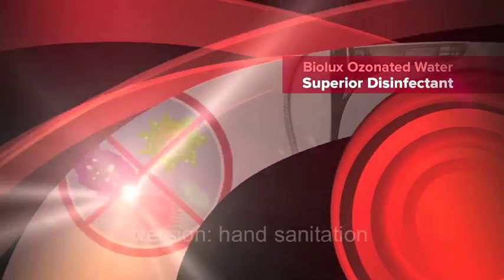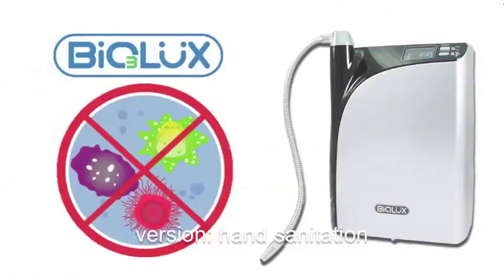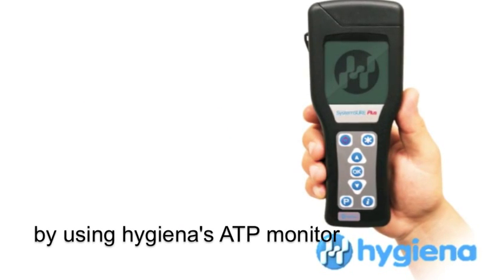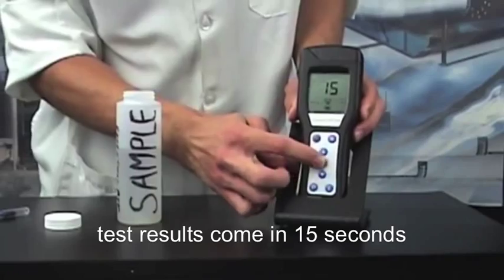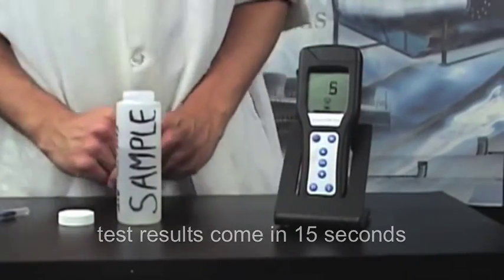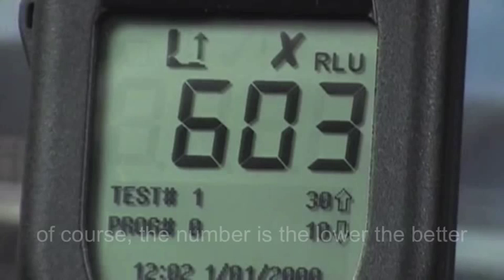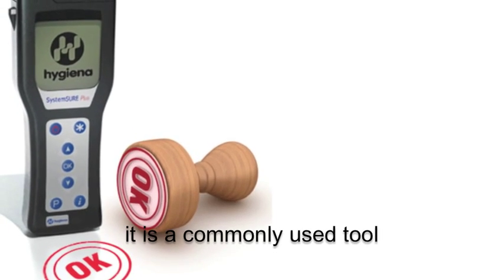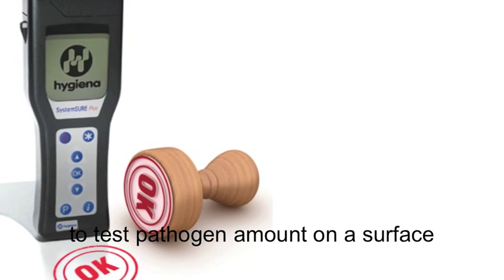Biolux ozonated water — superior disinfectant. This video tests bacteria amount by using Hygiena's ATP monitor. Test results come in 15 seconds and the result is shown on the screen. The lower the number, the better. It is a commonly used tool to test pathogen amount on the surface.